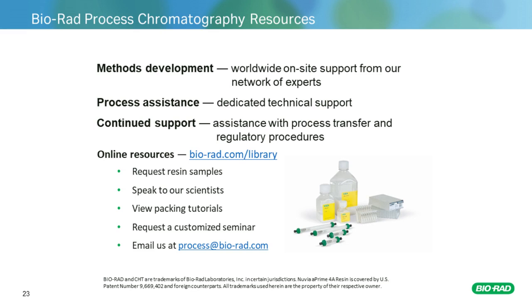Well, actually, you don't really need a very high concentration. And as I showed in the presentation, usually I would suggest you begin with 1 millimolar or 20 ppm. And you can also use it in combination with different concentrations of sodium chloride, depending on the exact interaction modes. Sometimes they work together pretty well.